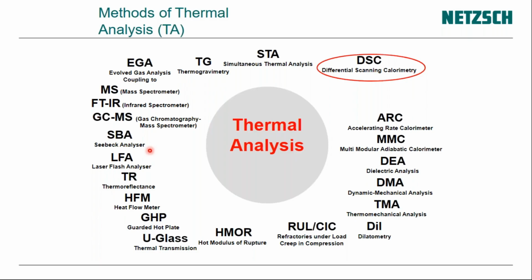We also have equipment like the LFA, the laser flash analyzer, for thermal diffusivity, thermal conductivity and specific heat measurement of a solid material based on the laser method.